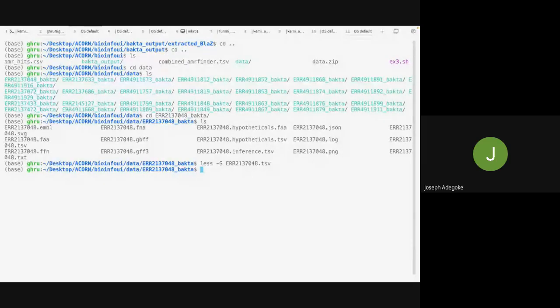Let's say there is a gene in the genome, and you found out this bacteria is resistant to this drug, so definitely it carries a resistance gene to this drug. Once you get your assembled file, you do the annotation first, and then you can search out the gene, or extract the gene, and then compare the sequence of the gene to other sequences.